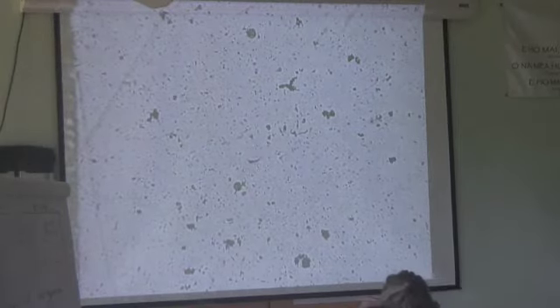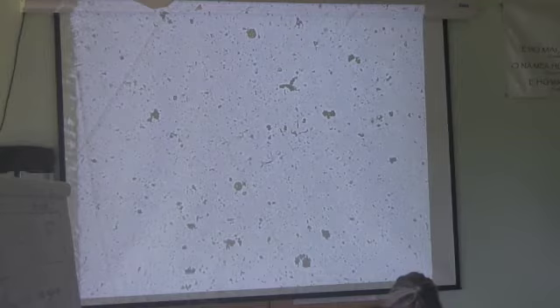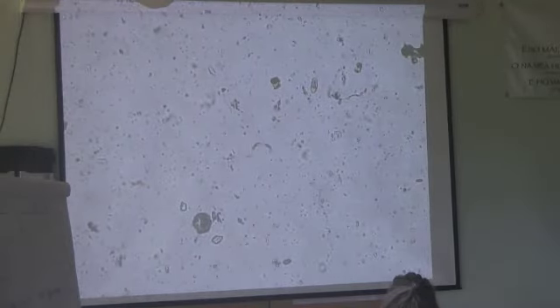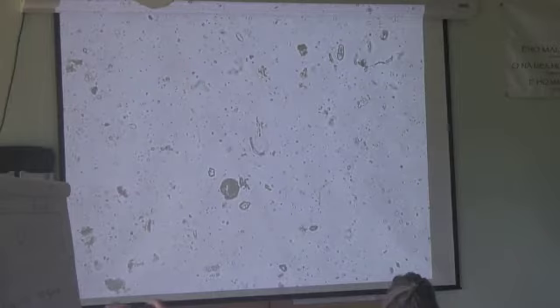There he is. See him? Nematode. This guy's a baby. They're all small like this. So now we want to identify him. So we're going to go after our 10x objective, that intermediate one, because it's way easier to focus on him one step at a time than to try to jump straight from our 4 to our 40, however many times we need him. You want to make sure he's in the center of your field, so now when we switch over to our 40, he's right there for us.